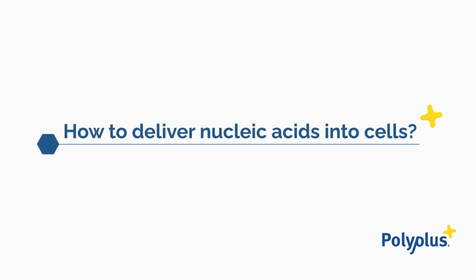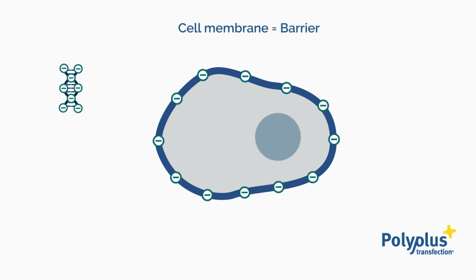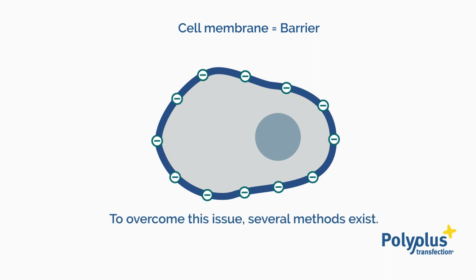Why use transfection? Nucleic acids are negatively charged and are repulsed by the cell membrane that is also negatively charged. Transfection is the means to overcome this issue.